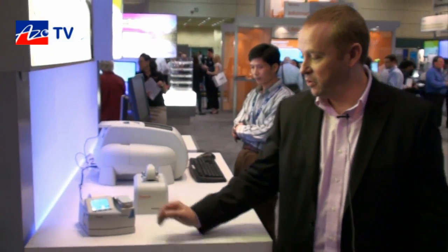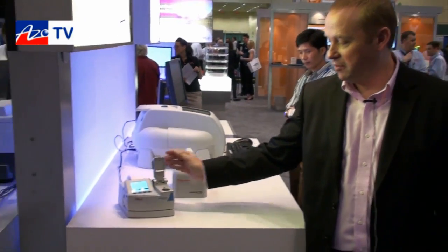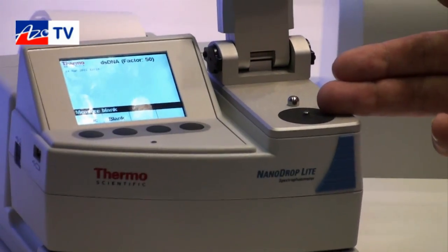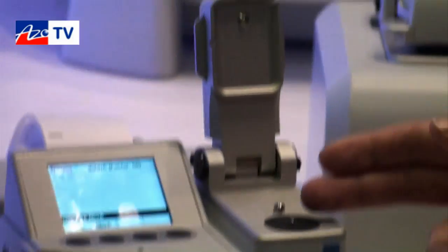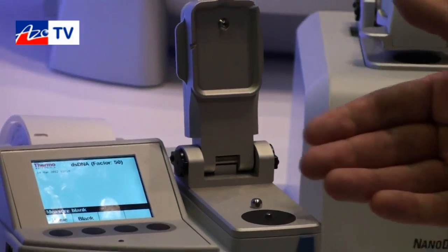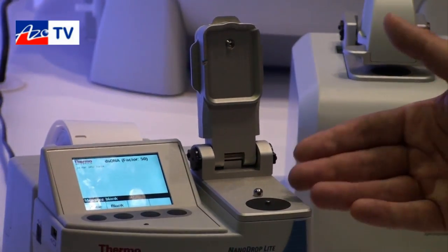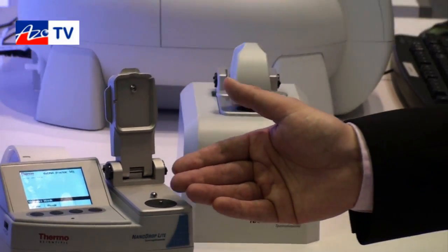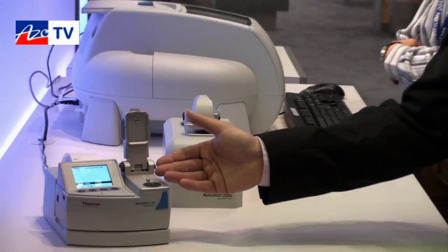And between samples, cleaning and maintenance is almost a non-issue — very straightforward. Because of the form factor of the pedestal, you simply wipe it with a kim wipe, here and here. Some researchers prefer to swab it with a little bit of buffer solution, but we've found that's not necessary because sample carry-over between samples is incredibly small.